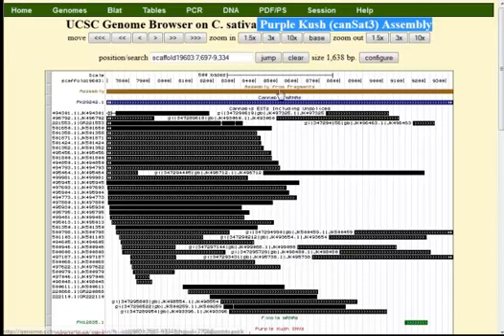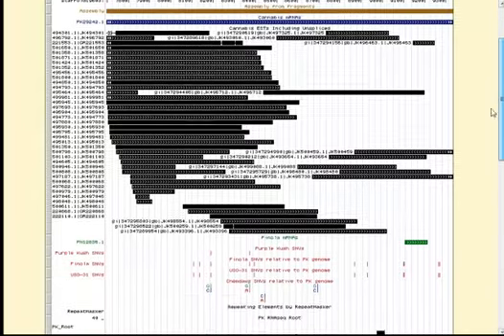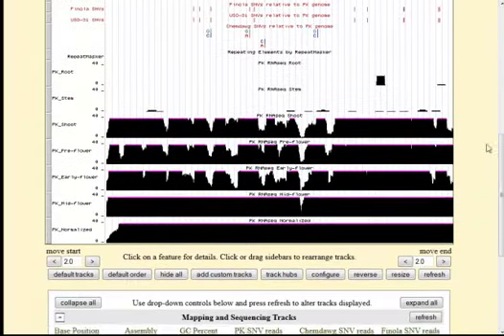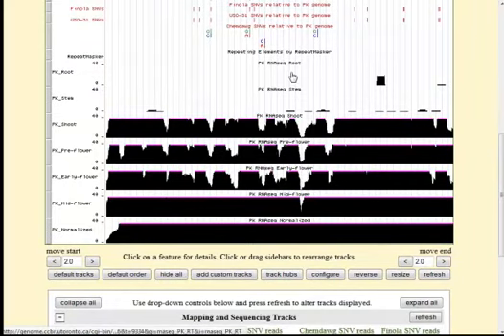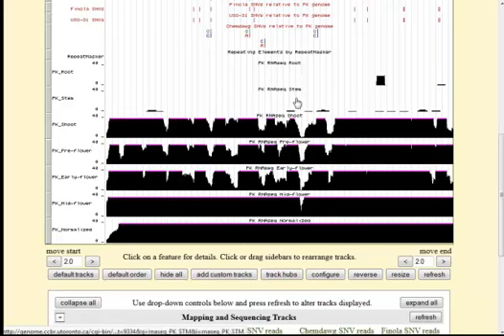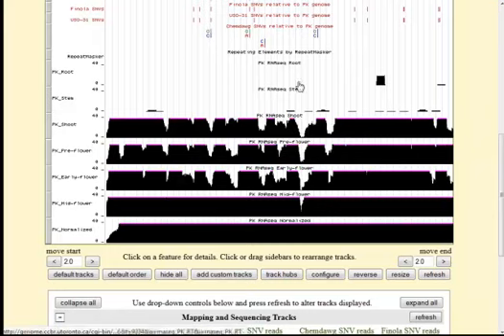Here there are some features that have been added to help you understand the genomic context. You can look at the mRNAs in this region, the ESTs, and variations — we'll talk about those more in a minute. You can also look at the transcriptome data. There's RNA-seq data here indicating that this gene is highly expressed, especially in flowers, but not expressed in root or stem. And if you go and look for this gene in the hemp plant, you'll see that it's not available and not expressed. That's one of the key differences.